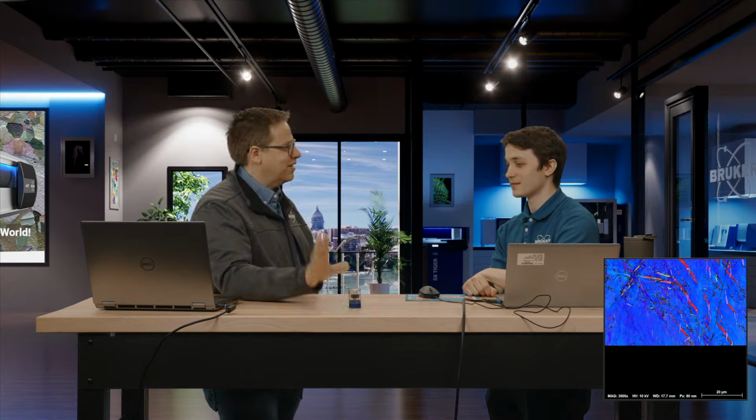All right. That's very telling to me, because sometimes you hear people throw out numbers, like, I can scan in a minute. But what we're seeing here is a real sample, one that a real person prepared, and you have real challenges in the lab, like you said, scratches. Anybody who's done one of these mounts knows, it's polishing that and then trying to get it etched right and doing all that. There are so many issues there. But you're saying real sample, real conditions, 10 minutes, EBSD. Yep, that's right. Wow. I mean, that's game changing. Yeah, to these techniques.